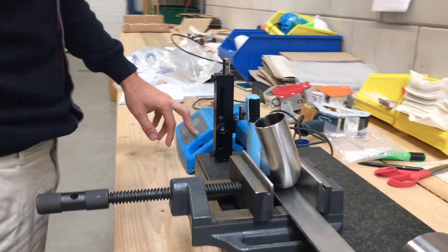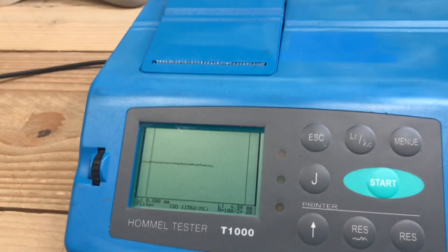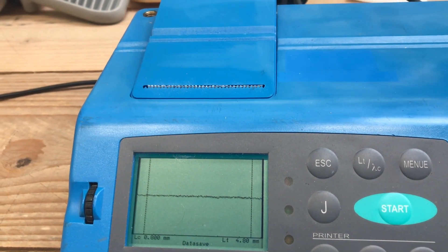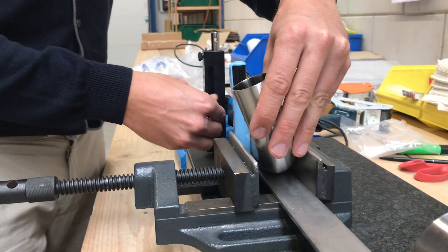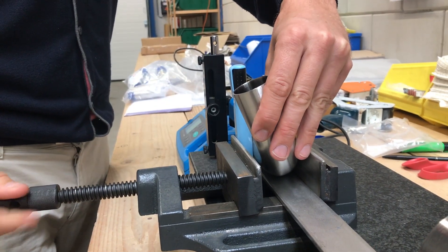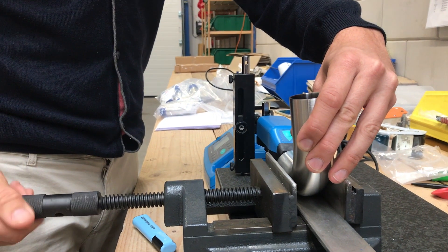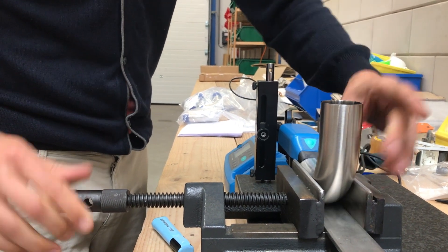We measure first angle position, 1.5 inch. Now we measure straight position.